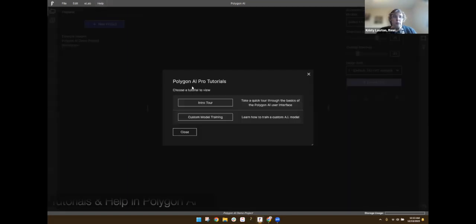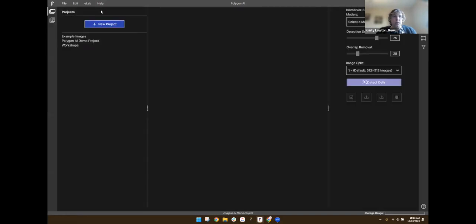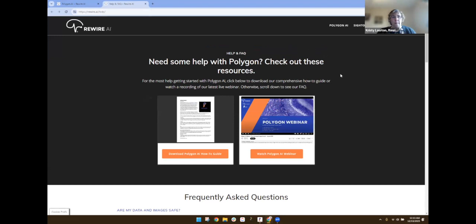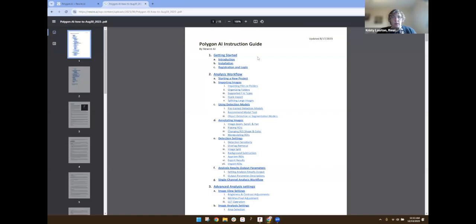We have some built-in tutorials, an intro tour, which is similar to what I'm doing now, and then a more detailed custom model training tutorial. And then we have very detailed help documentation on our website. If you go to this how-to link, it will send you to that website I showed you earlier, where we have the how-to guide that has an indexed list of hyperlinked sections, with quite a lot of detail on how to do different kinds of analysis.